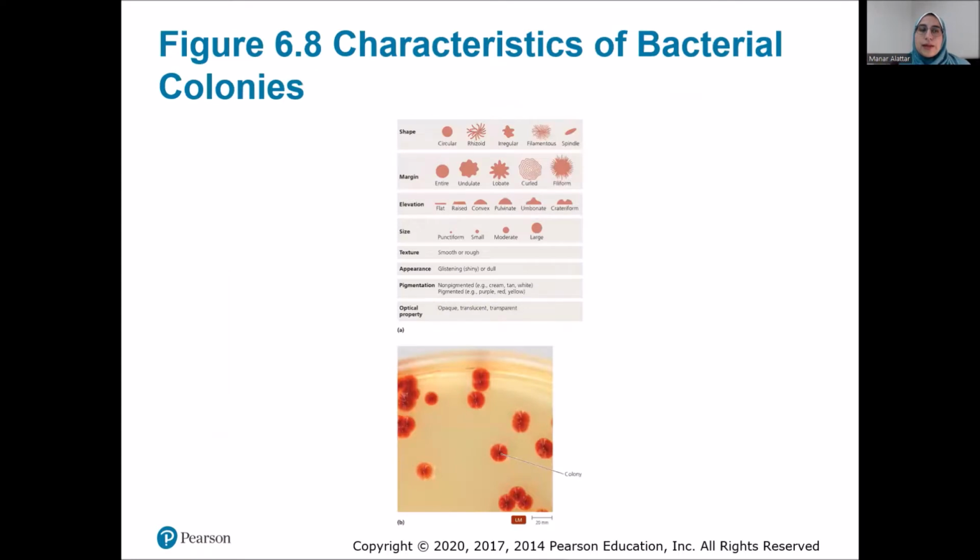Okay. And so the first step is often culturing those microorganisms, which you guys have done in the lab where you cultured an environmental sample, and then transferring individual colonies or individual kind of clones of organisms to new plates that you can basically isolate out, and you can see those individual colonies, and then you can do a series of tests on those individual species to see who they are or what they're doing in their environment.